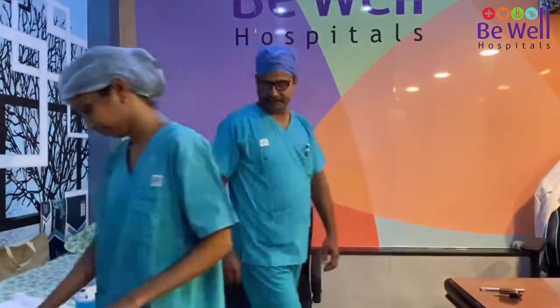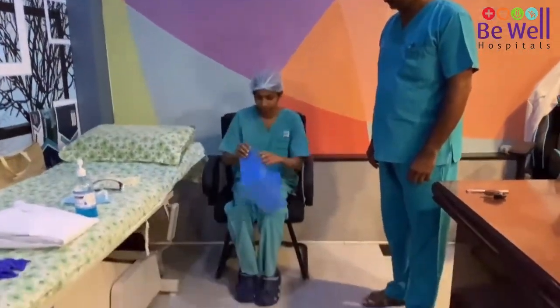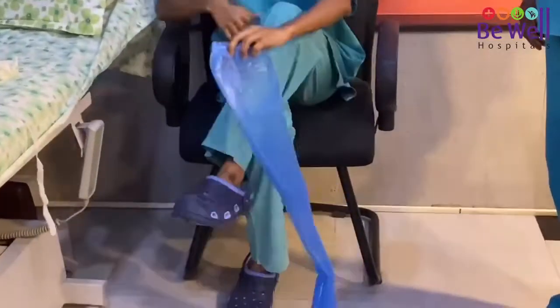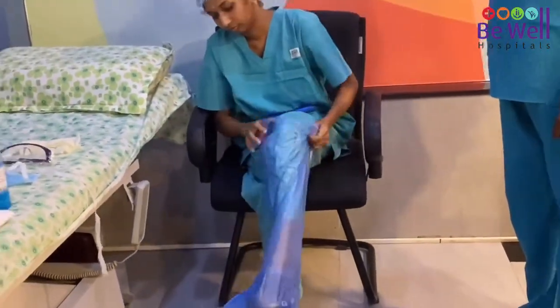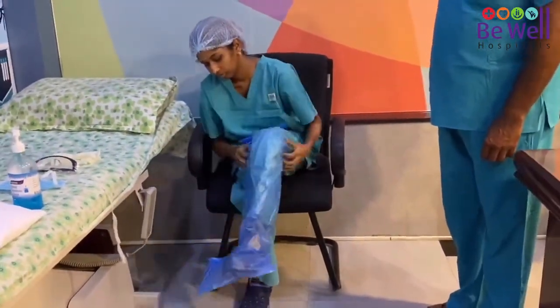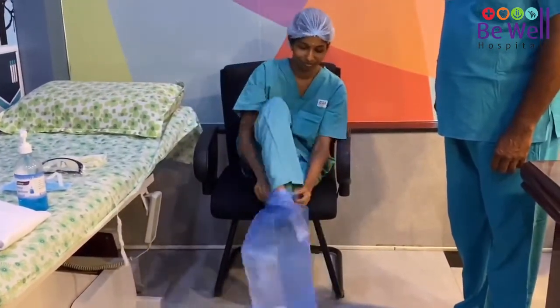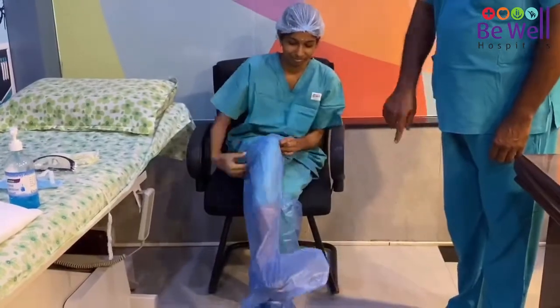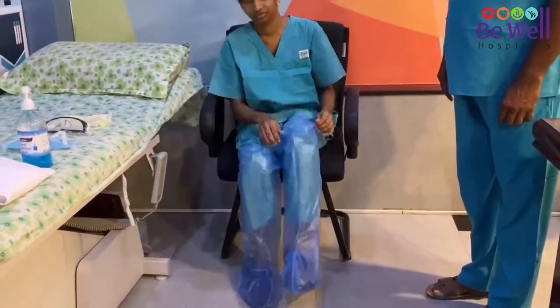Next, once you complete your hand hygiene, take your shoe covers — the first part of your PPE. Sit down and pull the shoe covers on up to the level of the knee. Adjust the shoe covers on your shoes so that you are able to walk and do not trip. The shoe covers should not have any tears or holes in them and must go up to your knee.